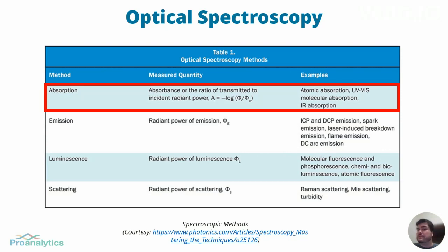of these bonds. NIR spectroscopy has advantages such as cheaper NIRS measurement equipment, the ability to measure absorption through thick container walls thanks to the longer path length, and much higher signal level for the same number of photons, resulting in lower exposure times. But NIRS has a major drawback for bioprocessing. It does not generate the same level of molecular specificity compared to Raman spectroscopy, which we'll discuss throughout the webinar.